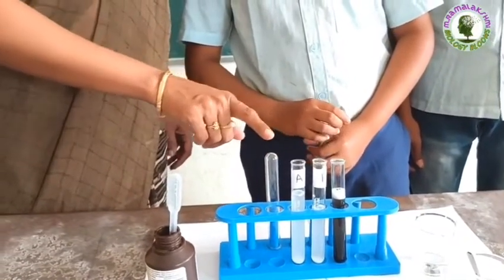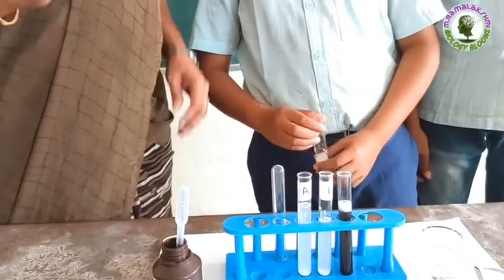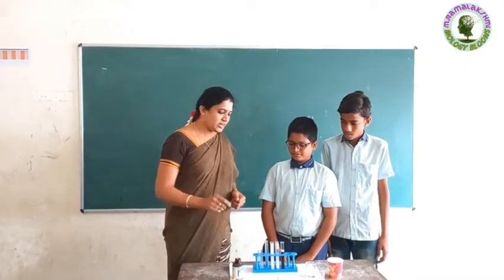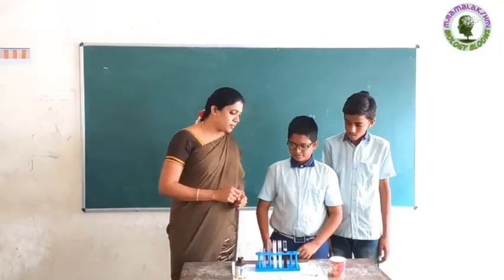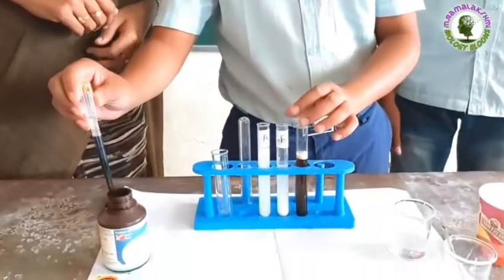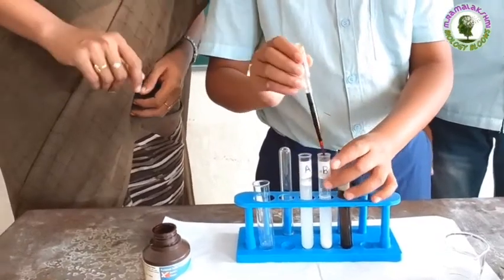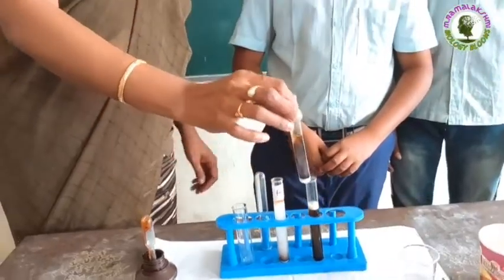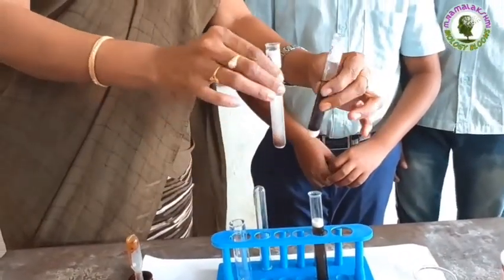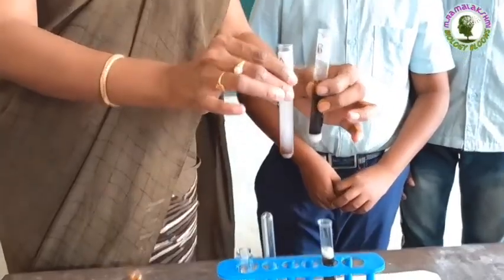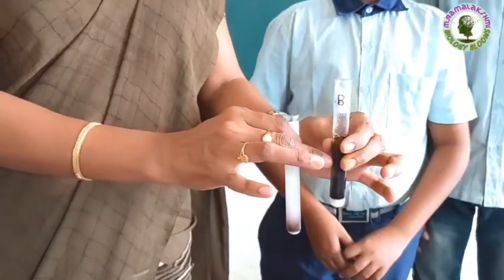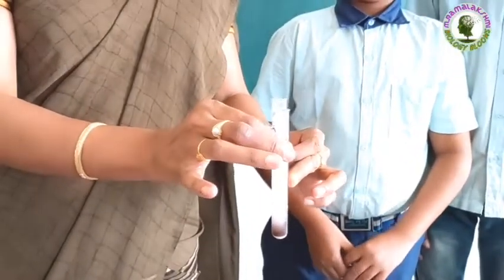After some time, we will observe and test with iodine to see what happens. So, Shyam, we added one or two drops of iodine into tube B and tube A. Observe the color changes. In both test tubes, how many drops are we adding? Two drops. We added two drops of iodine in this test tube and two drops of iodine in this test tube also.